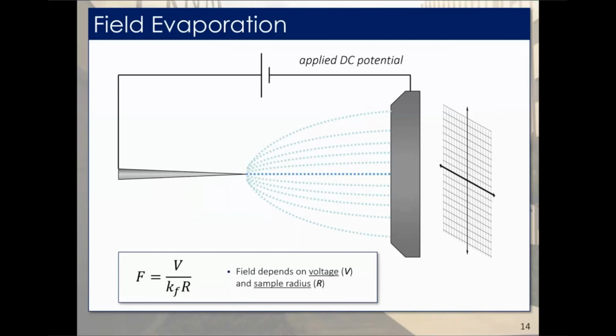How do we actually make this fine needle out of our sample? And how do we get the material feature of interest that we're after onto that needle? How do we make a needle out of that? The number of ways you can make atom probe samples are quite varied, especially if you want to get into some more exotic sample materials.